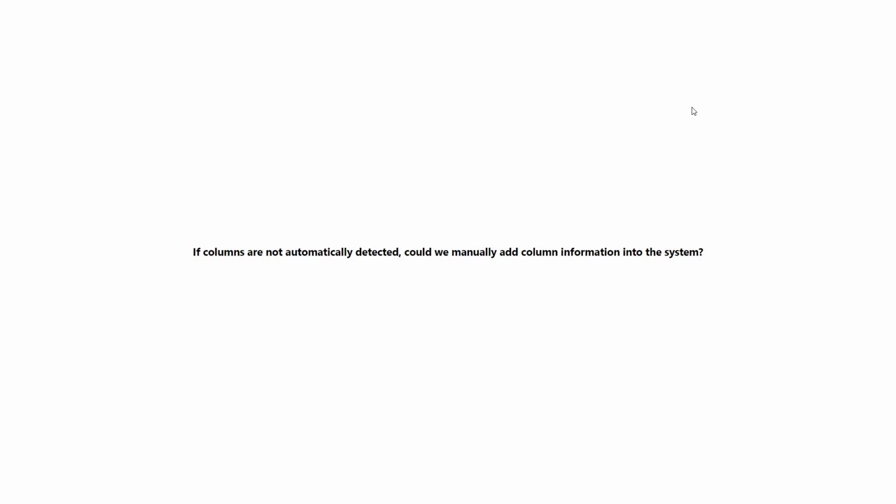And then the serial number field would be, you would enter the serial number. So there are 2 fields already built in, column name and serial number. But if you needed more information, you could create sample custom fields to enter that. So again, maybe you want to put in the part number or the particle size or something like that. You could create sample custom fields for those additional pieces of information. Okay, great, good, thank you.